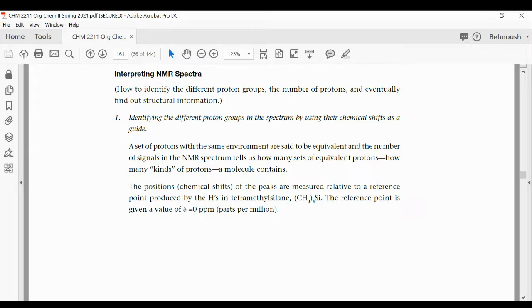I was going to ask a question, but then I just ratified what you said in my head, because you said if there's a peak at 1700, there is the ketone, right? A peak at 1700 means that there is ketone. Yes, exactly. For a moment I heard impurity, and I'm like, no, I think she said no impurity. Yes, if there is no peak. Good.